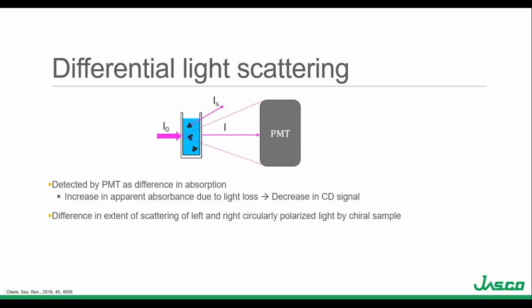Because chiral samples have different refractive indices for left and right-handed circularly polarized light, the amount of scattering for the left and right-handed components can differ, which changes the magnitude of the CD peaks and distorts the spectrum. The distortion depends on the size and shape of the particles and the refractive indices of the sample and solvent. To avoid differential light scatter, the particulate size should be less than one-tenth of the wavelength of the incident light. For hydrogel, solid, or high-salt biomolecule samples, this is why FTIR is sometimes used as a better secondary structure analysis technique, since FTIR uses significantly longer wavelengths.